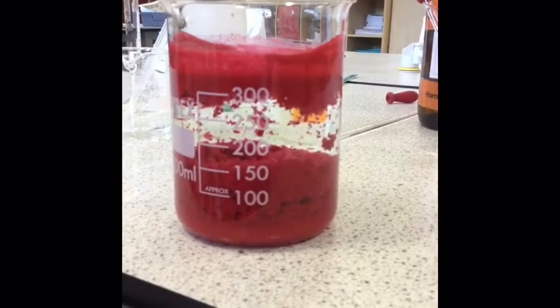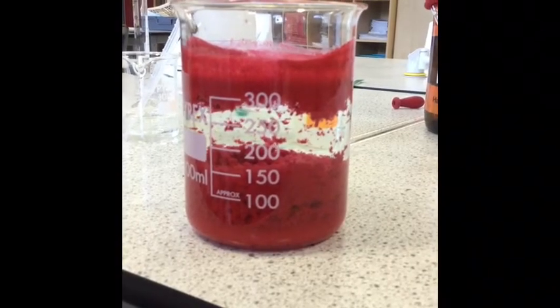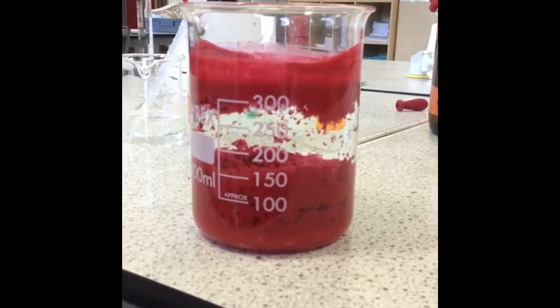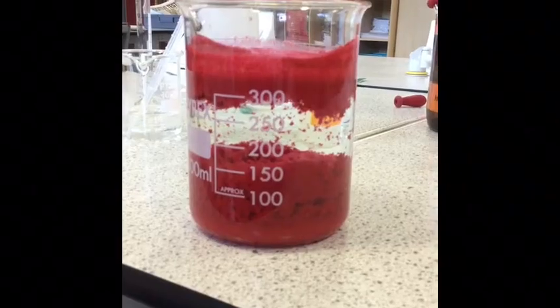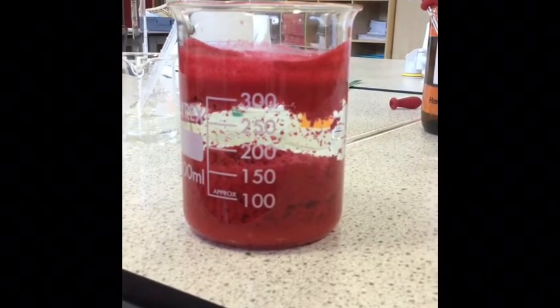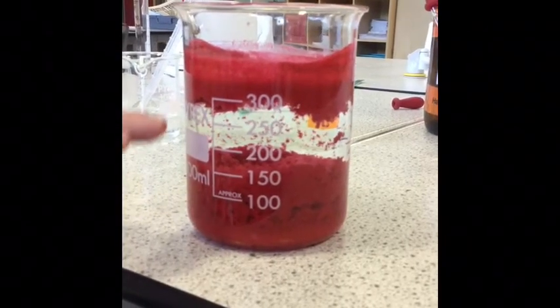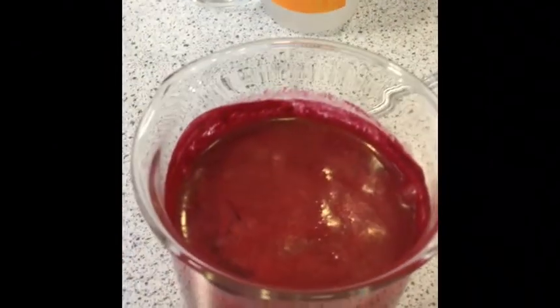Right, so we've left the sample now to cool down for, well, it says half an hour, probably left it a bit more than that. But as you see, this seems to happen most times. The whole precipitate doesn't fall down to the bottom. Some of it does, but some of it stays at the top. But you've got this clear liquid in the middle. So what we want to do is to test whether or not there's still some nickel ions in that area.